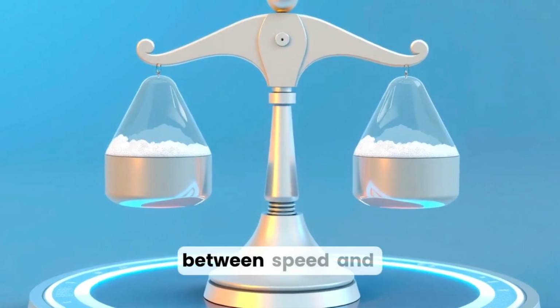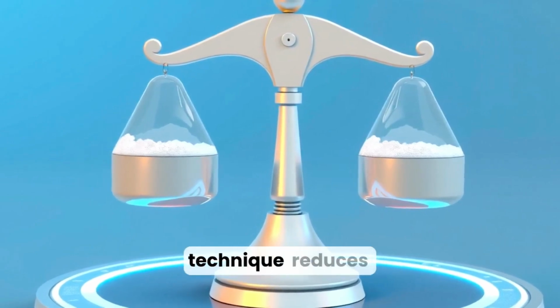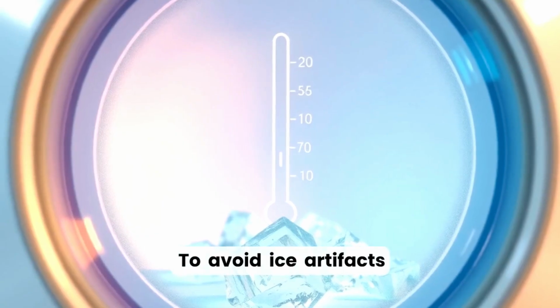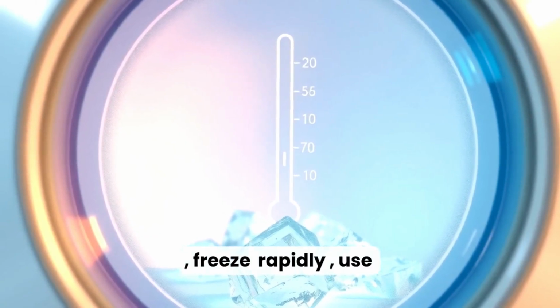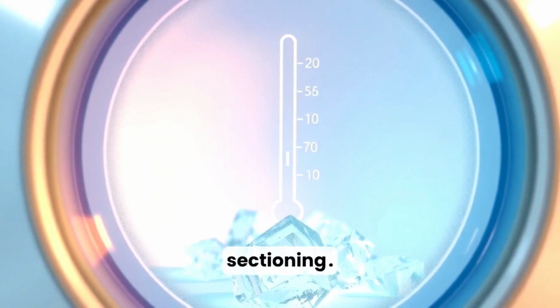Remember the trade-off between speed and quality. Rapid results are valuable, but poor technique reduces diagnostic accuracy. To avoid ice artifacts, freeze rapidly, use appropriate embedding, and maintain stable cryostat temperature during sectioning.